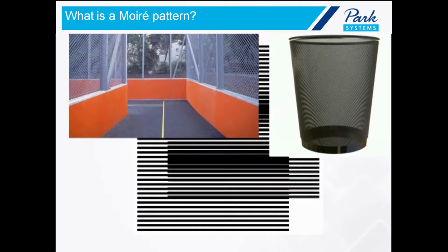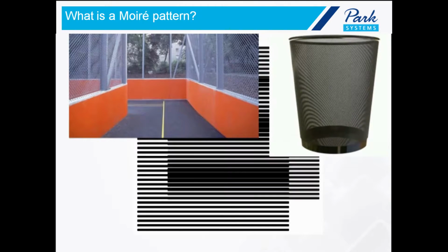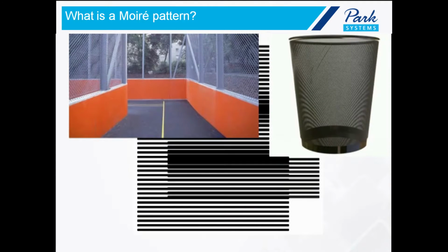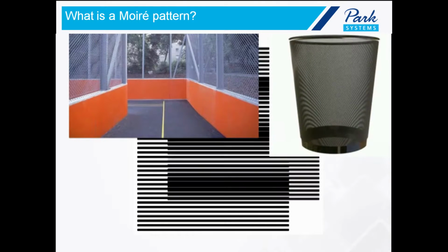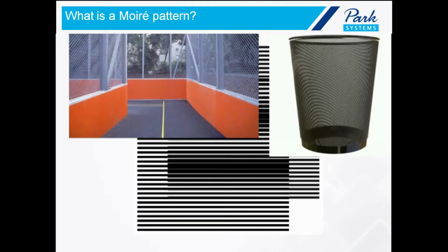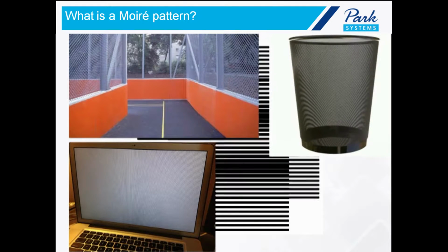At a park of some kind, wire link or wire chain fences, same exact thing. The holes in the fence have a specific periodicity. The distances between each of the wires in the frame are of a constant length, right? And as you move past the chain fence, there's an interference pattern that results there.